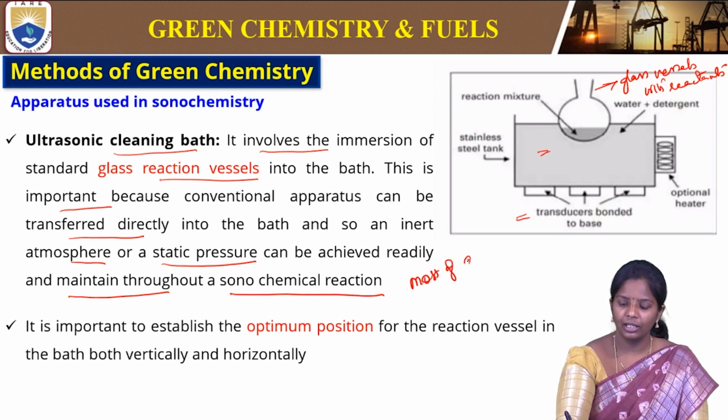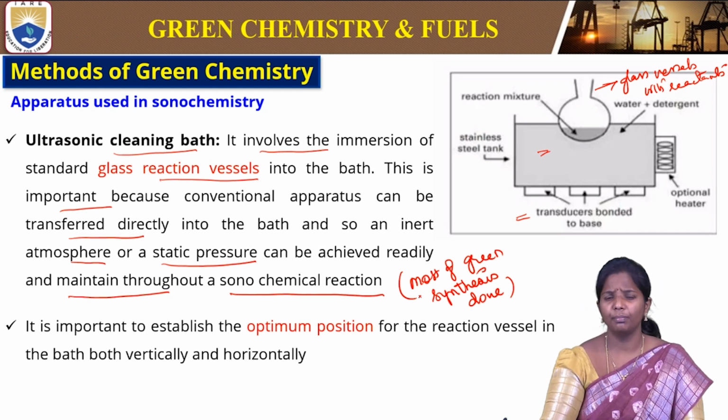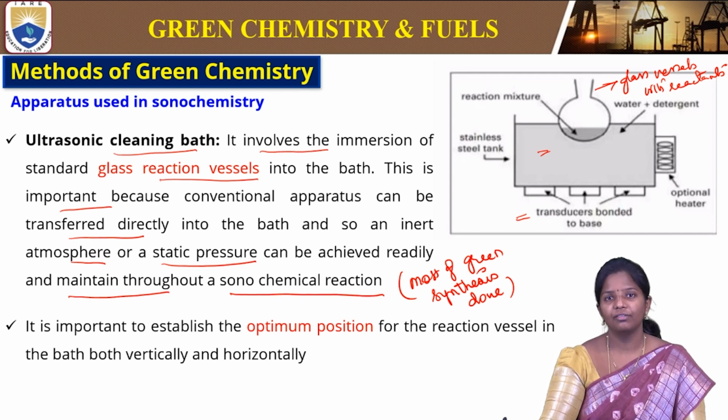Most of green synthesis is done using this ultrasonic bath. It is a simple and reliable technique that can be used for any chemical synthesis. Therefore, it is green synthesis. The input of electrical energy is also very low, so even for production plants, it works well.